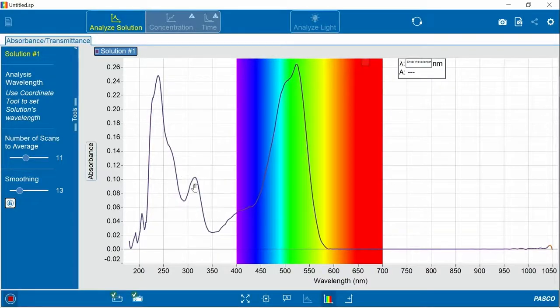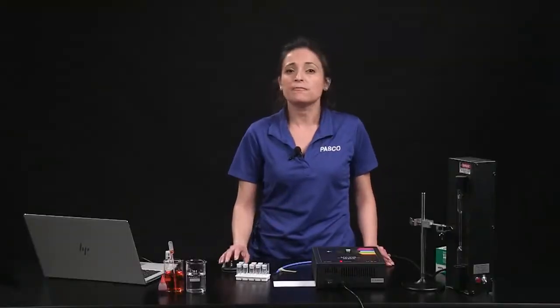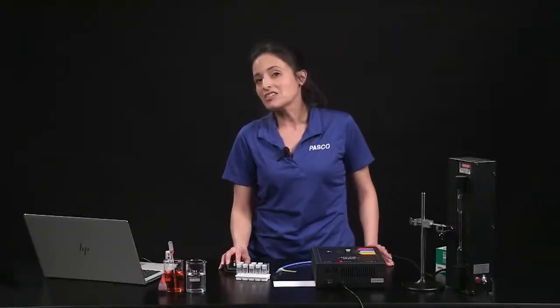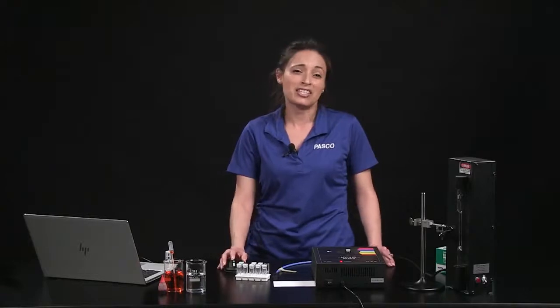Allowing mostly red and other wavelengths to be transmitted through the solution to our eyes. You can also see that the spectrometer detects some light absorbed by the solution here in the UV region. Our eyes can't see this. The UV region appears here because the molecule in the red food coloring contains a highly conjugated organic molecule with many adjacent double bonds.